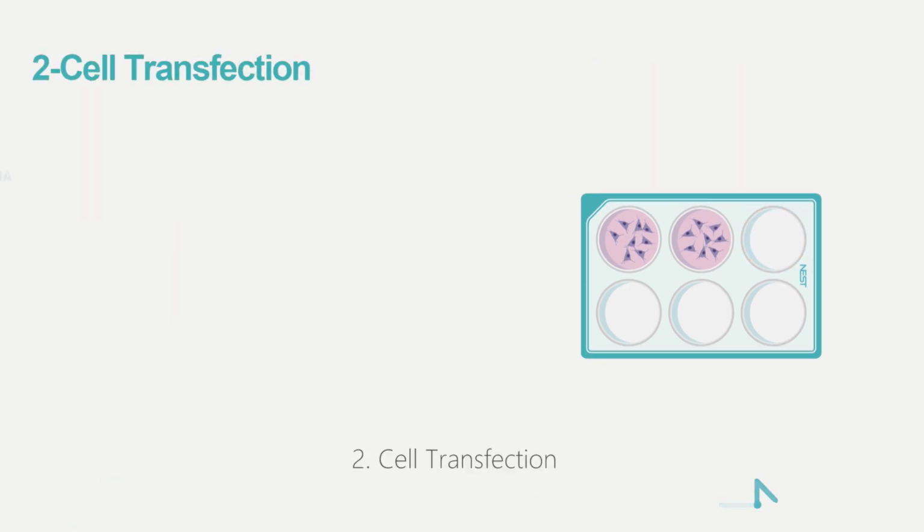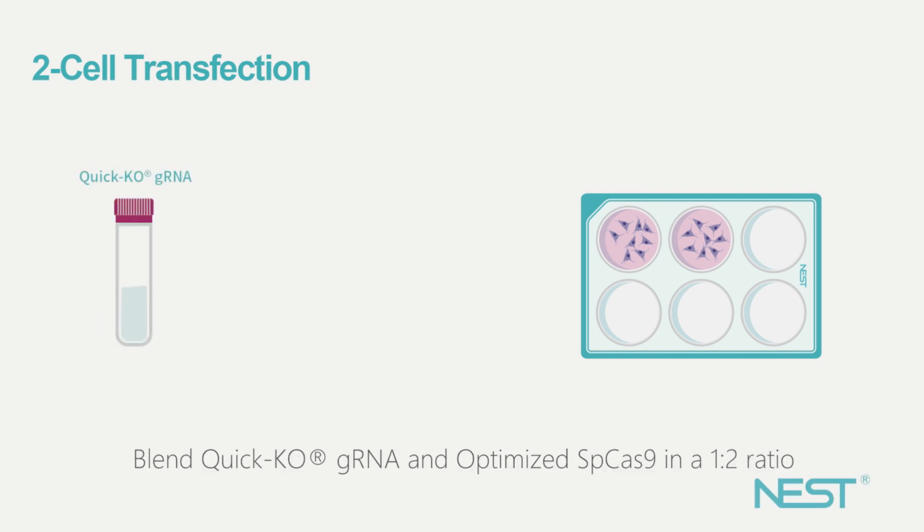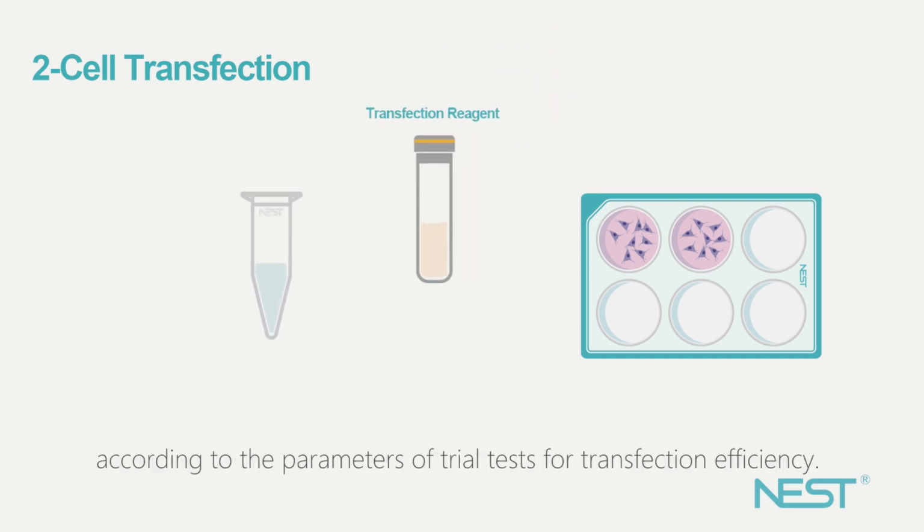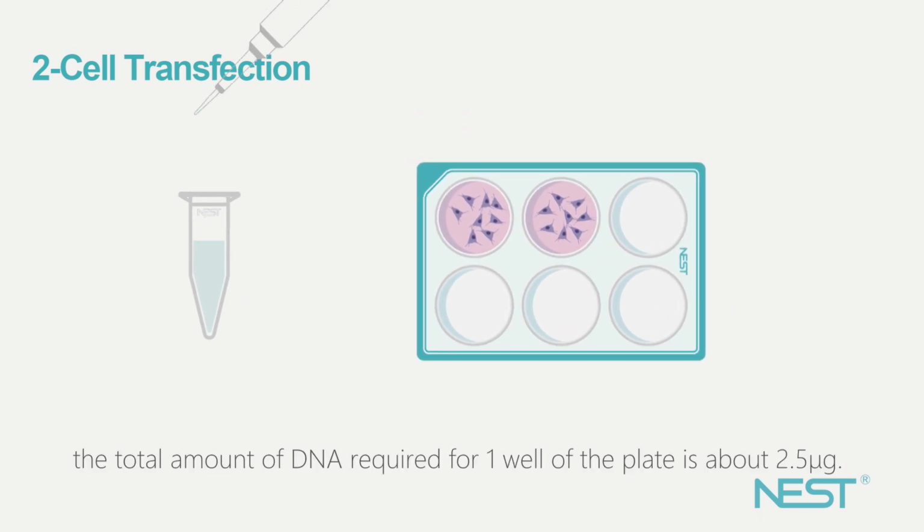Second, cell transfection. Blend QuickKO guide RNA and optimized SpCas9 in a 1:2 ratio, and transfect target cells according to the parameters of trial tests for transfection efficiency. Typically, the total amount of DNA required for 1 well of the plate is about 2.5 microgram.